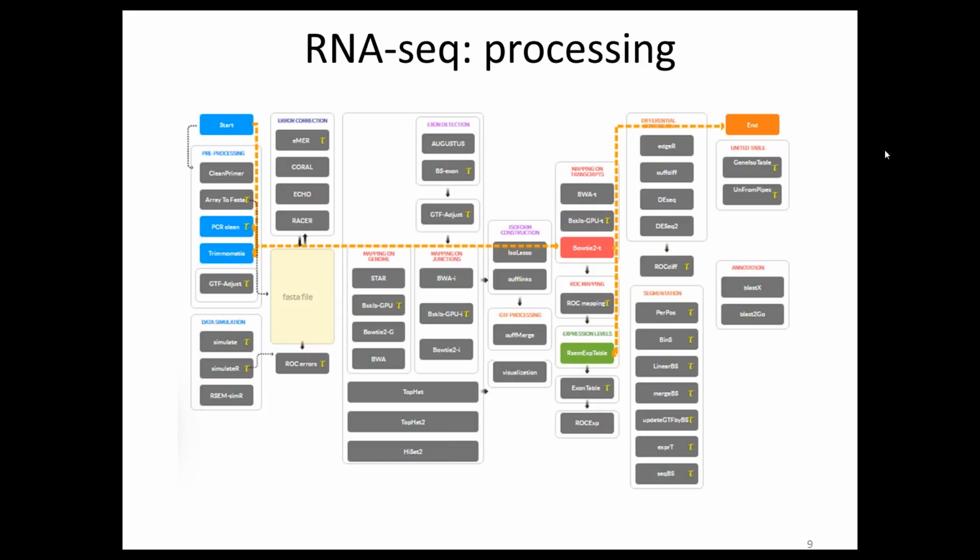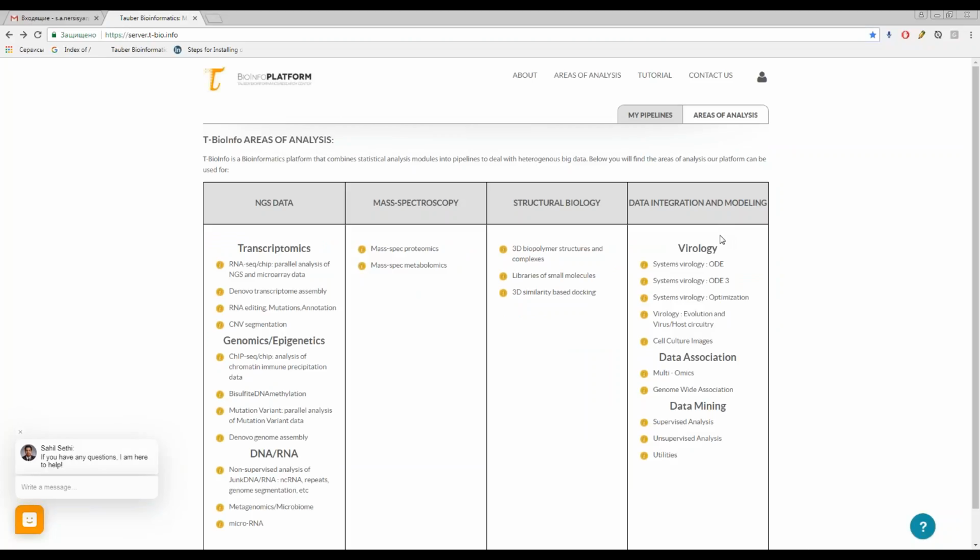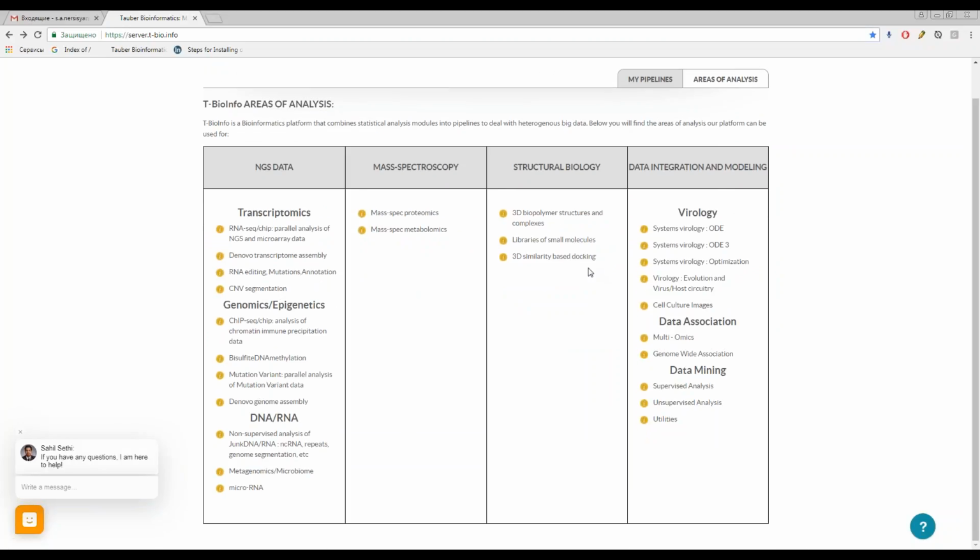Now I will focus on my browser. Hope you see it, and hope you are all logged in the platform. Please let me know in chat. Yeah, so right now I don't see, let me see. Okay, yeah, so I see now the platform. Yeah, please let us know if you already got your platform credentials. If you are an observer and you're just watching this to learn, this platform is available. You can contact us and request access to the platform, and we can continue talking about that. But all the people that joined and registered ahead of time were supposed to get an email with their platform details.